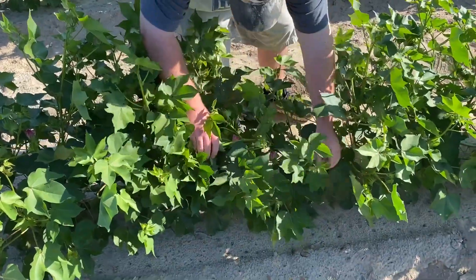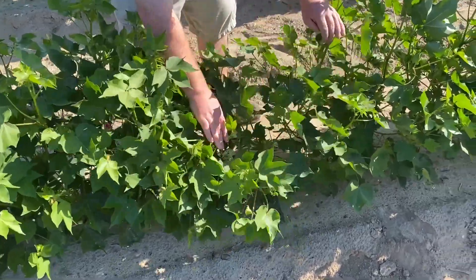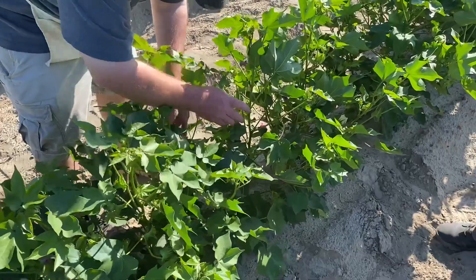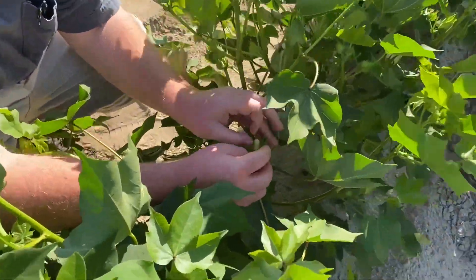When crossing cotton plants, a total of two days are required. The first step when making crosses is to find what is called a candle, which is a mature flower that has yet to open on the mother plant, in the afternoon of the first day.